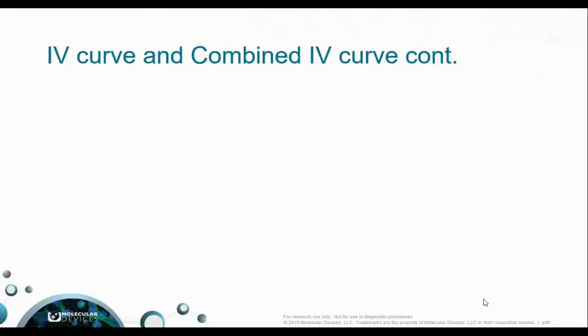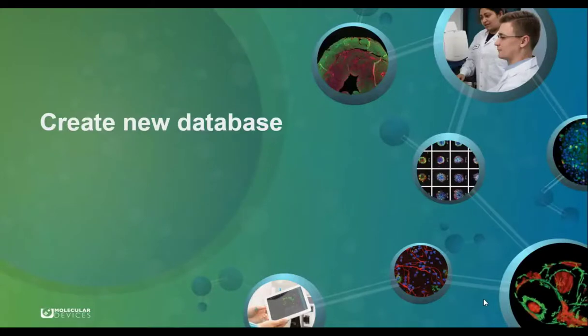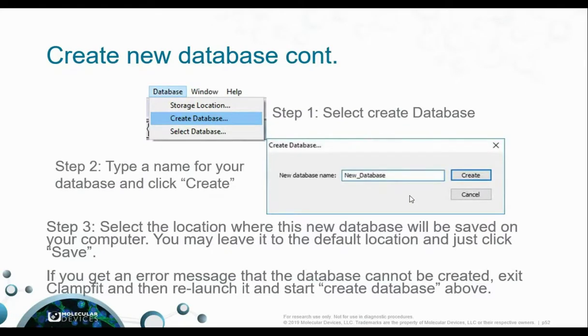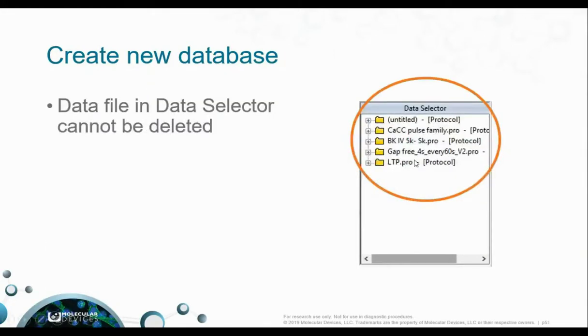Now let me go back to my PowerPoint slide. I have finished my demonstration to show you how powerful the batch analysis is. The next question you will meet is that the data files in the data selector cannot be deleted. As you keep importing data to the data selector, you will have a lot of data in the data selector window, but it cannot be deleted. So what we can do is create a new database, so that you can empty the data files in this data selector.